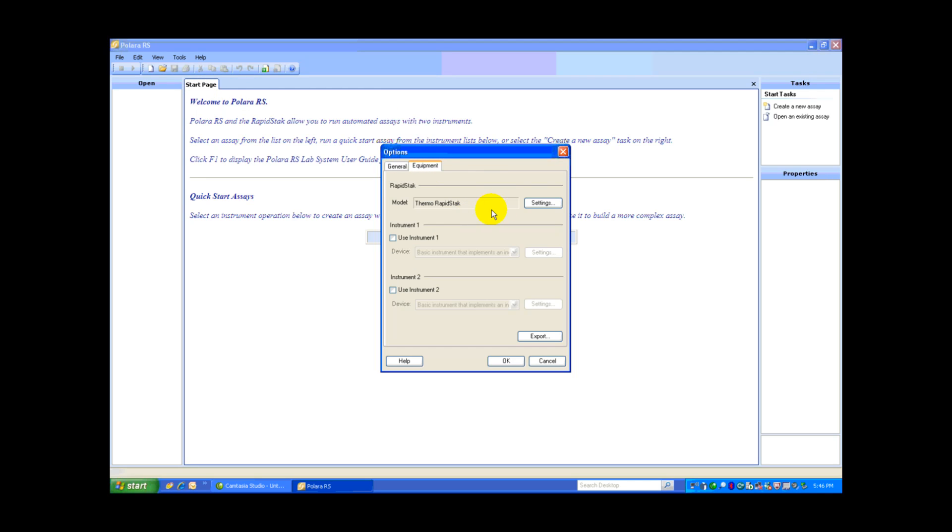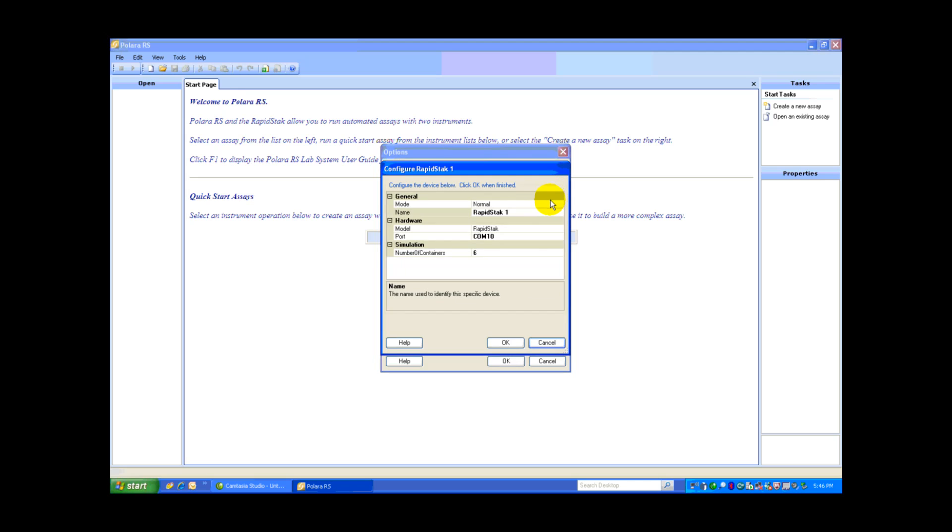You'll see we have a RapidStack selected here. If we click on the Settings, we could switch this to Simulation, but we are connected to a RapidStack, so I'm going to leave it at Normal.